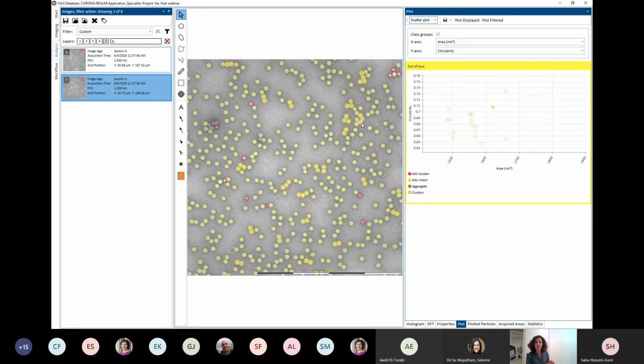Whether we can then correlate it back to a function or not, that is sort of up for discussion. But one of the things that we think is fun and valuable is to get enough data. When we talk about 100,000, 20,000, tens of thousands, and getting really heavy statistics to start seeing any potential subtle variations, but variations that are coming up frequently, that can be attributed to whether the samples are slightly more elongated, or have got something different in terms of their spike coverage and so on.